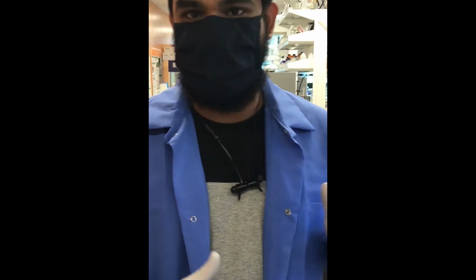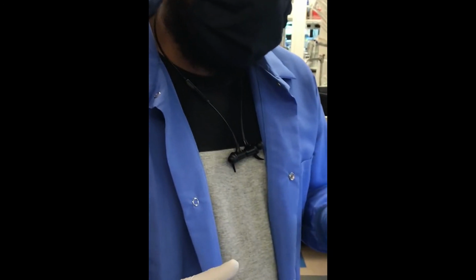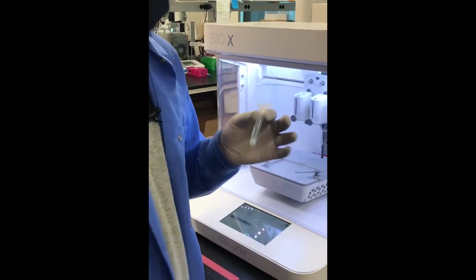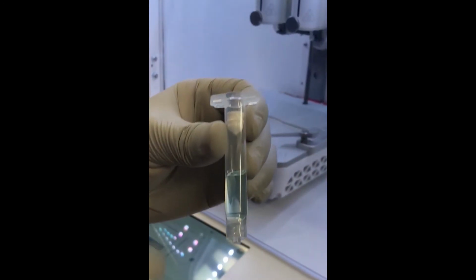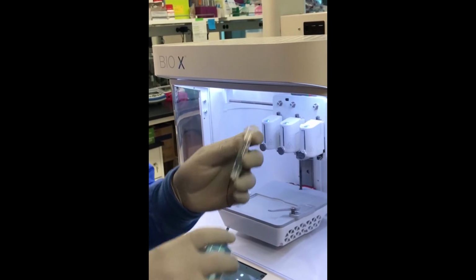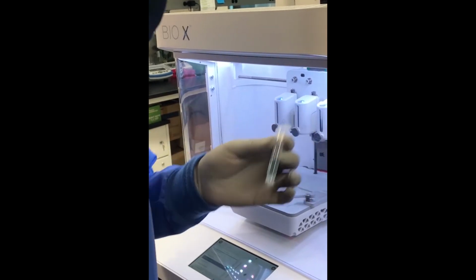So I'm going to walk you through what you would do to print. I'm just going to print a very basic cylinder. The first thing you want to do, we're going to use the pneumatic print head, and for the syringe, it's just a pneumatic syringe, and here you see it's filled a little bit with the Cell Ink Start Bio Ink, which we got here. It's really easy to do. There's a connector that you can connect it with and push through the amount you want.